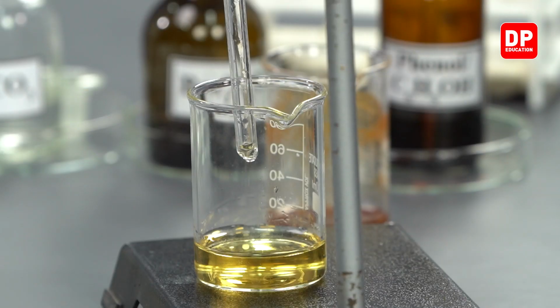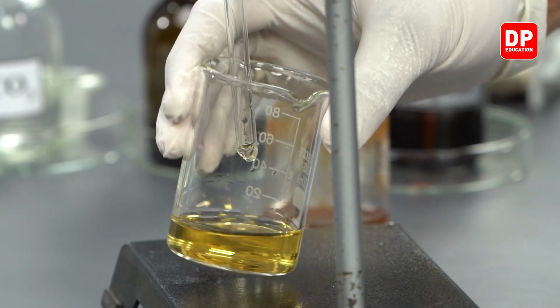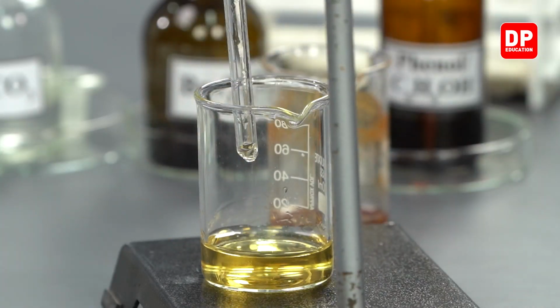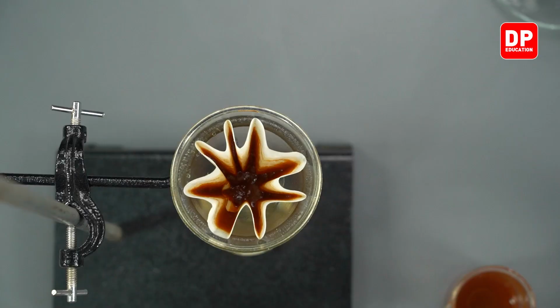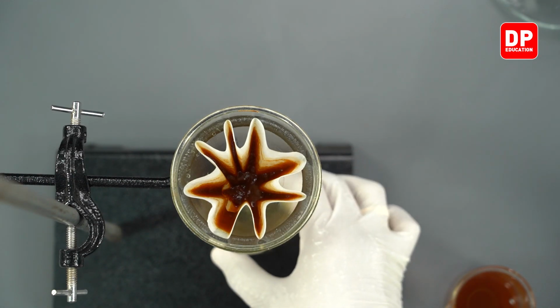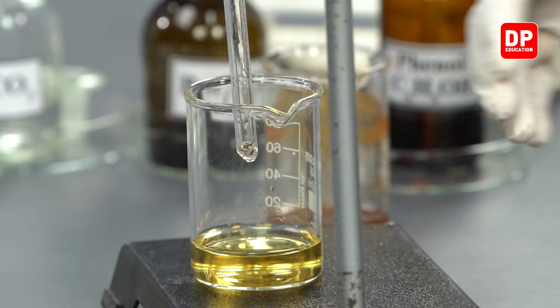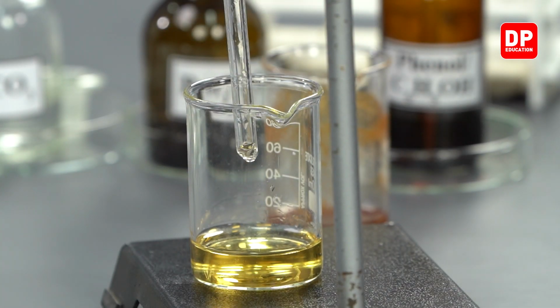We have our neutral ferric chloride solution here. Neutral ferric chloride solution is present here. The precipitate is present in the filter paper. The ferric hydroxide precipitate is present on the filter paper, and the filtrate will contain our neutral ferric chloride solution.